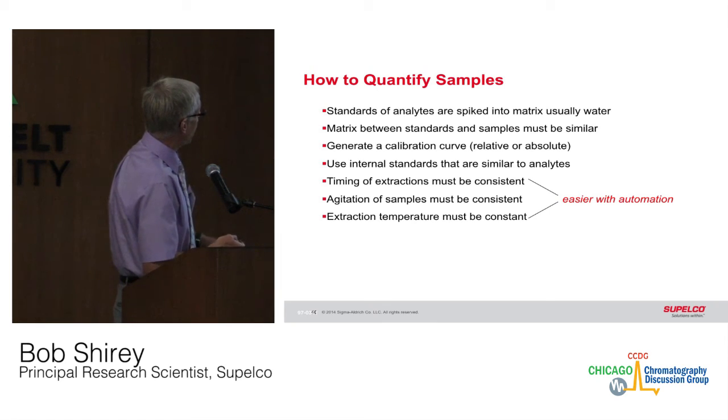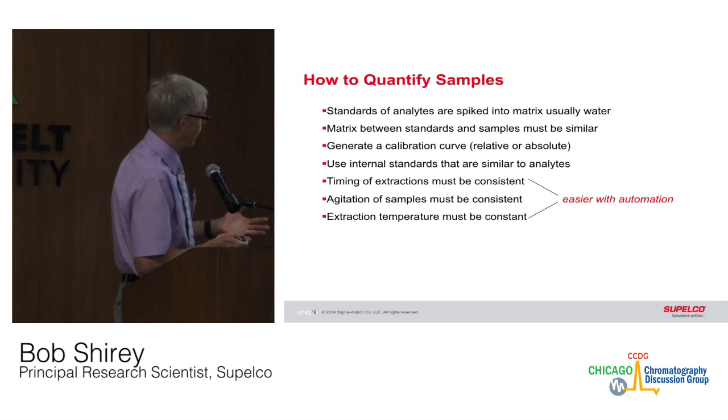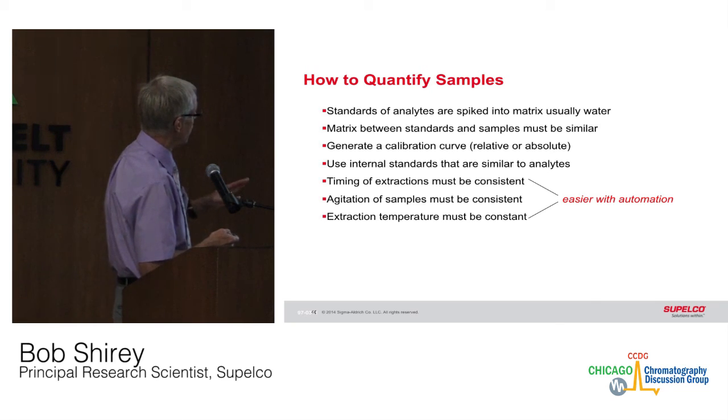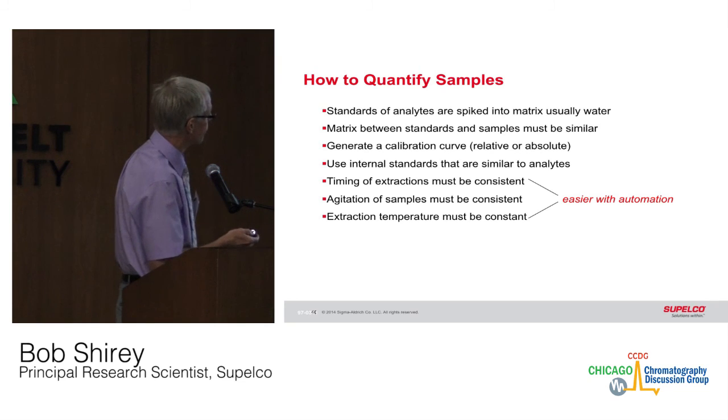I'll briefly go into how to quantify samples. Most of the time you just spike your standards into the same type of matrix that you're analyzing, usually water. The matrix between the standards and the samples must be similar. You want to generate a calibration curve. Use internal standards that are similar to the analytes or behave similarly. And all the extraction parameters must be consistent, and that's easier to attain with automation.